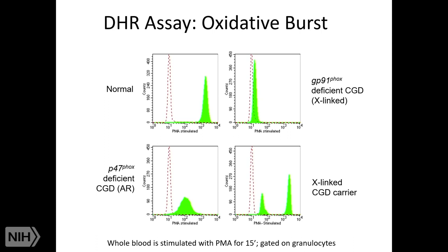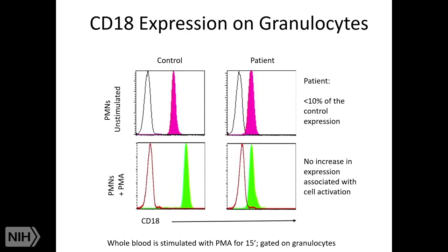So here, when the patient inactivated the wild type, she has all the cells sick, they're not producing reactive oxygen species. And this is when she inactivated the mutated one. So females, because they have 2, you can track the X chromosome activation doing this test that's called DHR.